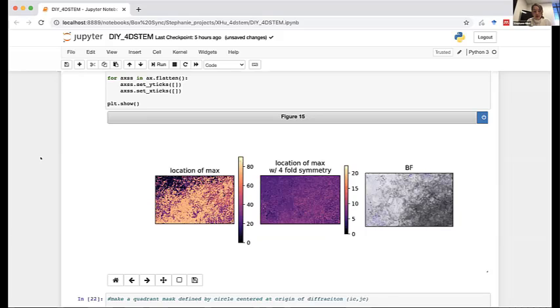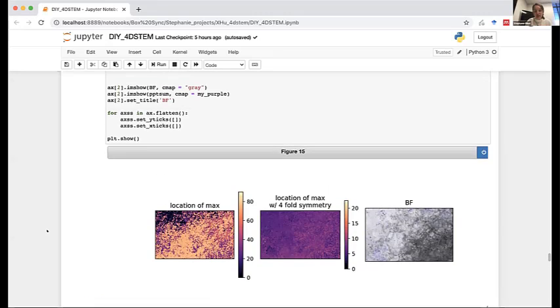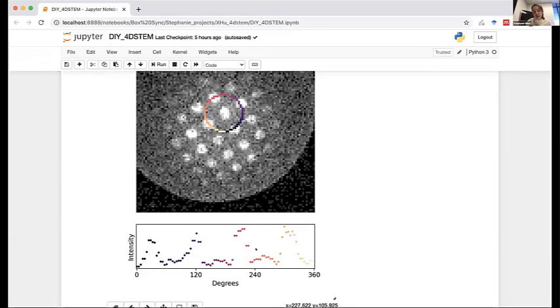Totally. And I think that Python is a really good tool to do that, because when you have an idea like that, you can start to think about how to build your own detector or collect that kind of information in a different way. We're about to talk about how you can use a quadrant detector to collect information about what's on opposite sides of your sample. But you could imagine building something like a quadrant detector, but with a lot more segments in your diffraction pattern, and you can collect relative intensities in each of those and try and create some sort of map of symmetry within your sample. That's not something we've explored so far, but you could use tools like the quadrant detector, or even the ring detector, thresholding the number of peaks to try and assess that kind of information. So yeah, definitely.